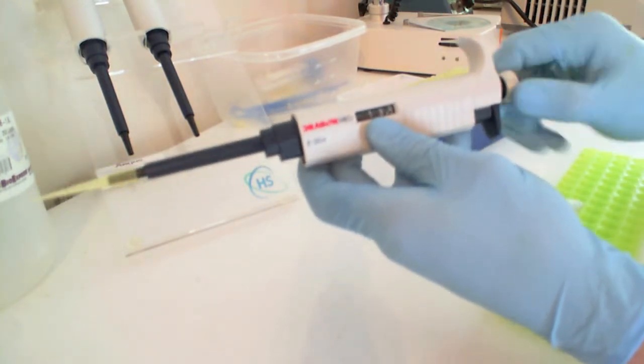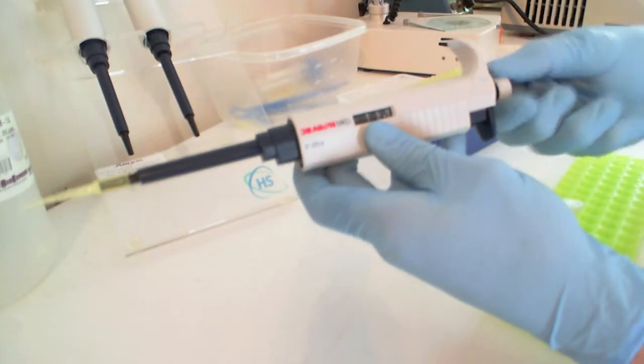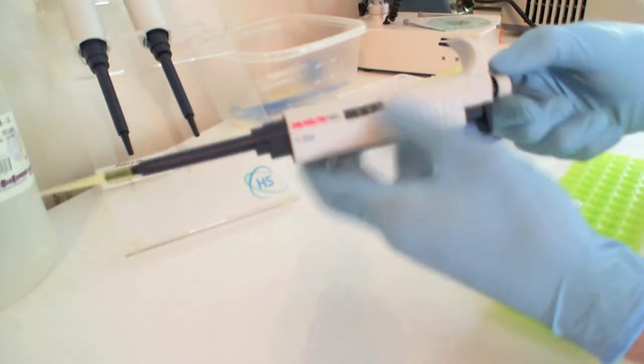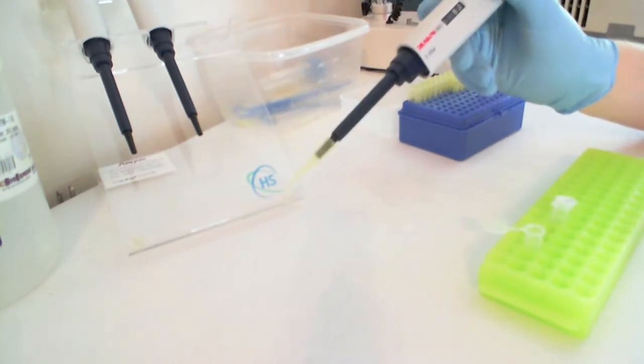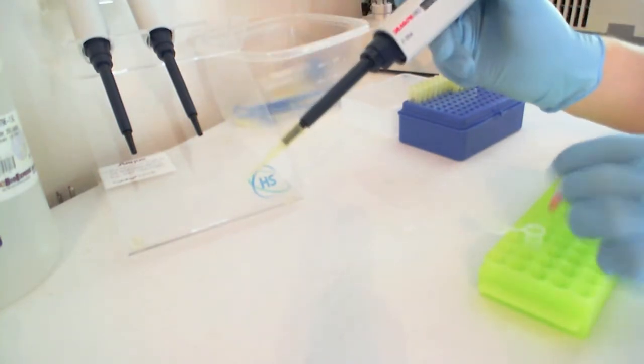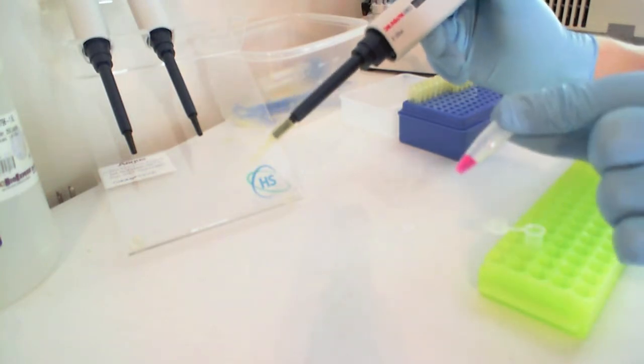Change the volume setting on the pipette by twisting the dial on the back. To use the pipette, hold the pipette in one hand and your tube with liquid in the other hand.